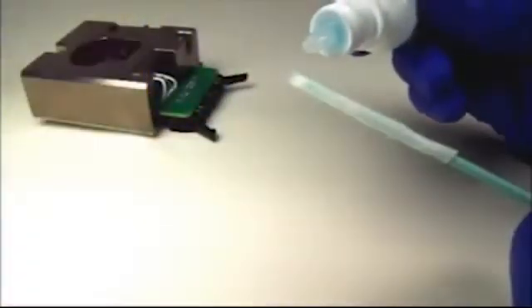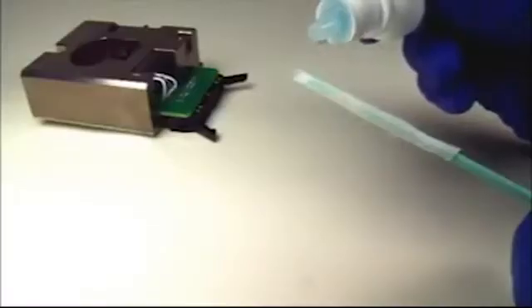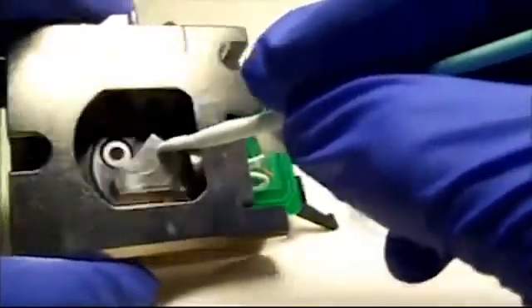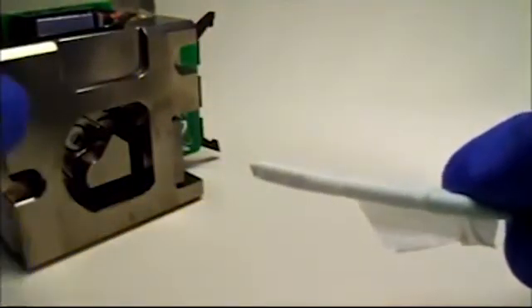Start inside the chamber. Wet a kim wipe in the isopropyl alcohol or cleaning solution, and scrub all the metal surfaces. You'll be picking up sample particles and chemical residues, so expect to use multiple wipes with the alcohol.